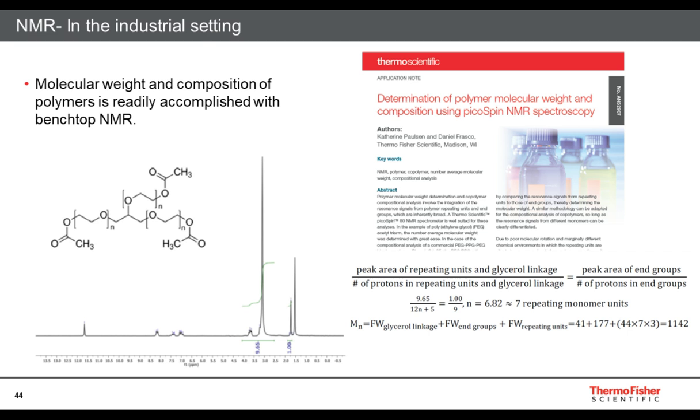At an advanced level or an industrial setting, you see NMR used in a variety of different ways for reaction monitoring and all sorts of things. But one we see a lot in industry is determining the molecular weight of polymers. So polymers start with these simple chains and then they're reacted through a process which causes them to grow and grow. But determining the average molecular weight of that composition is something that manufacturers work with because it determines a lot of that polymer's characteristics. And so they need to figure this out.